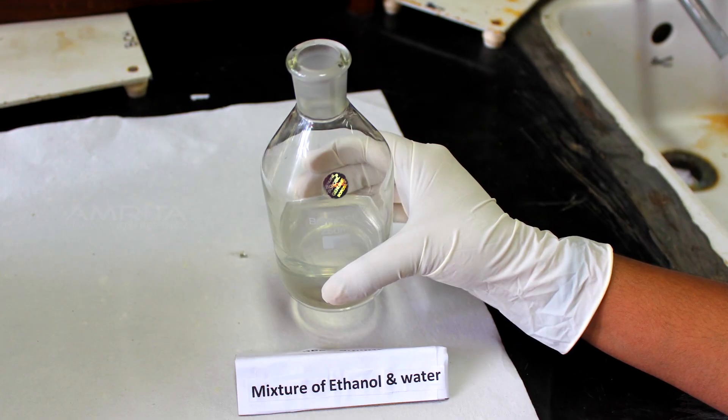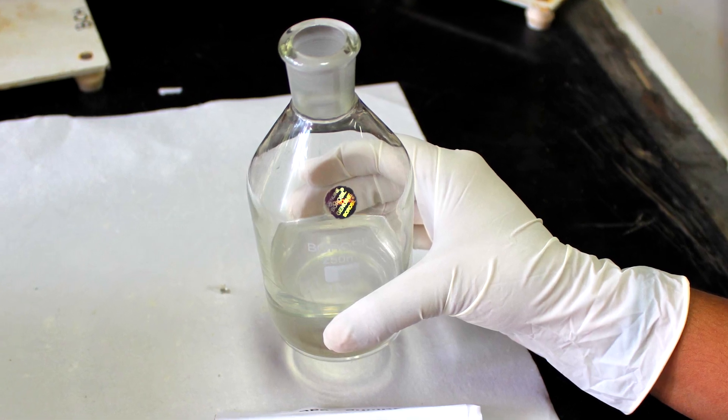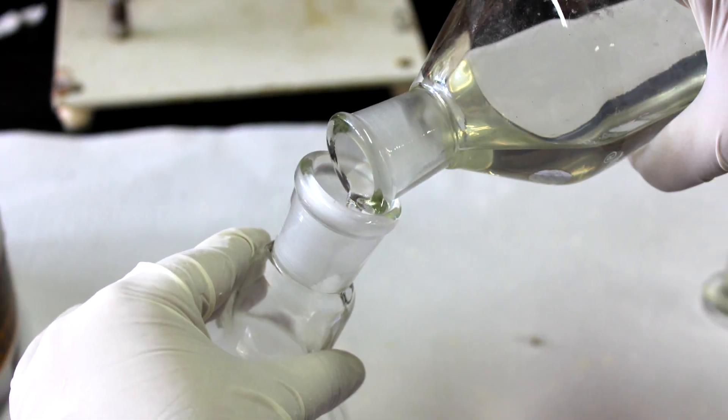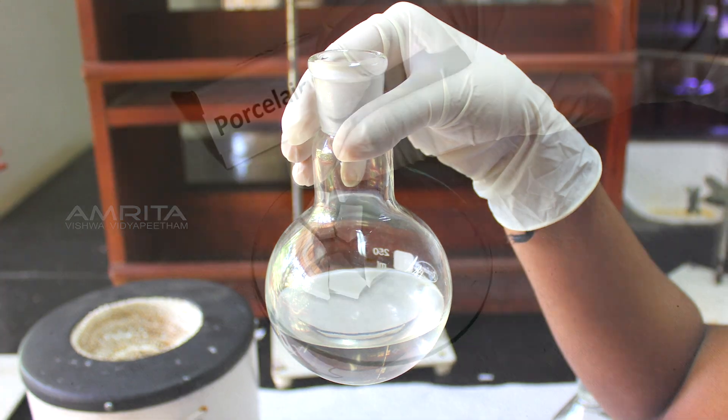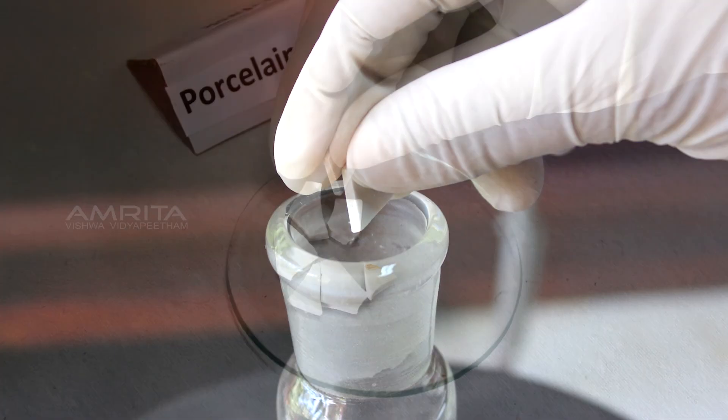Procedure. Take a mixture of ethanol and water and pour it into a 250ml RB flask. Take some porcelain chips and put it into the mixture.